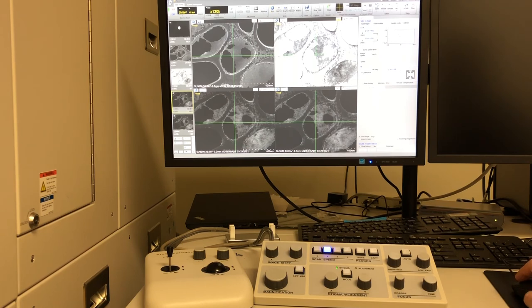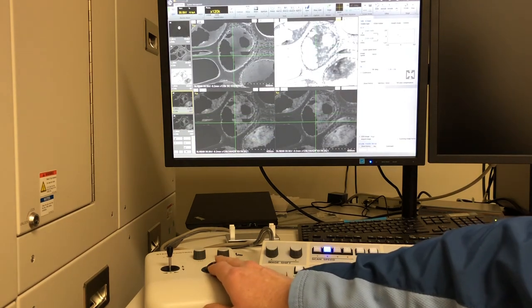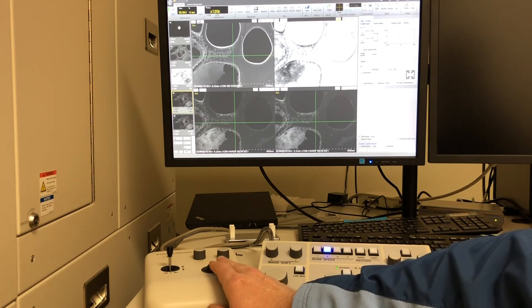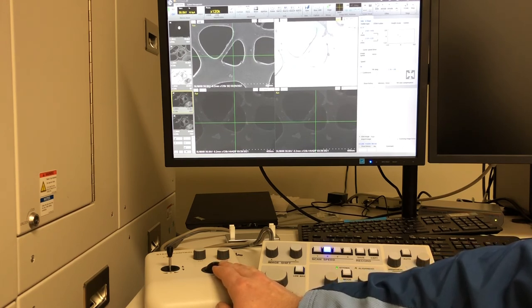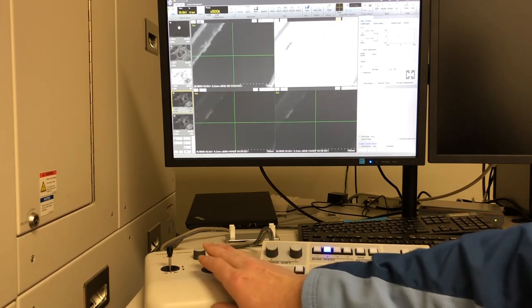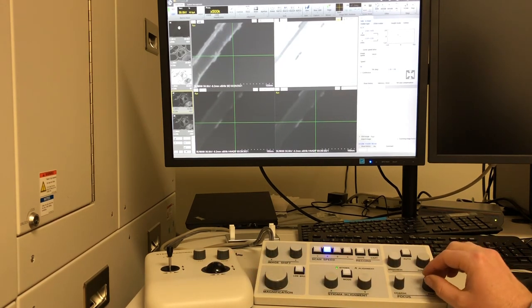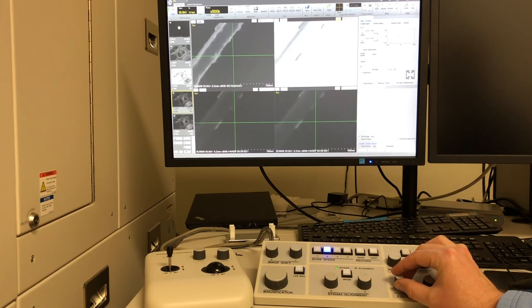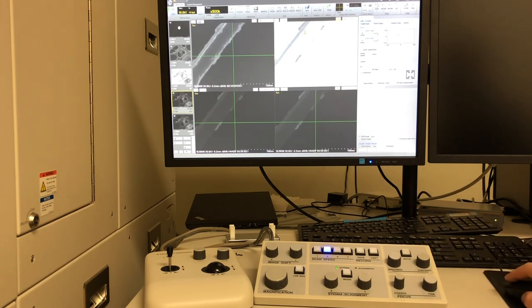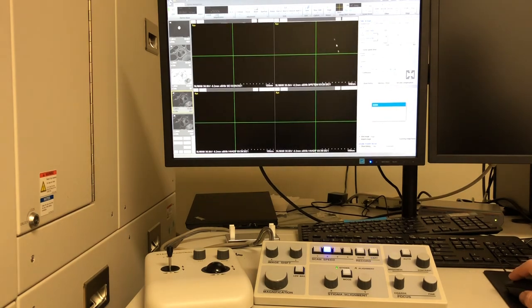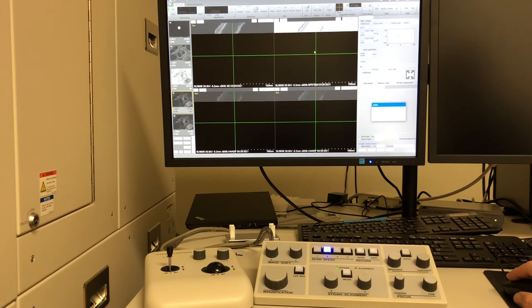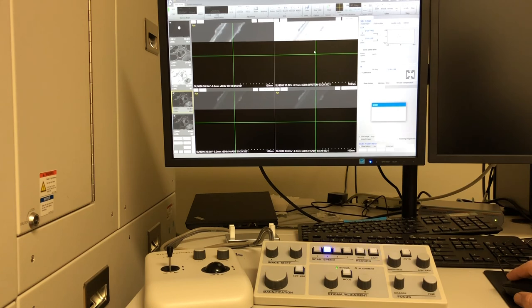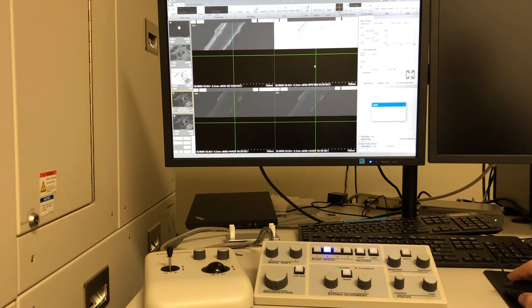Go over to this area on the lacy that's over the vacuum. Zoom in with the magnification button, then focus. I'm focusing with the coarse focus. And then we can press slow again to save what we're viewing. And that's how you will be making images with the SU-9000.